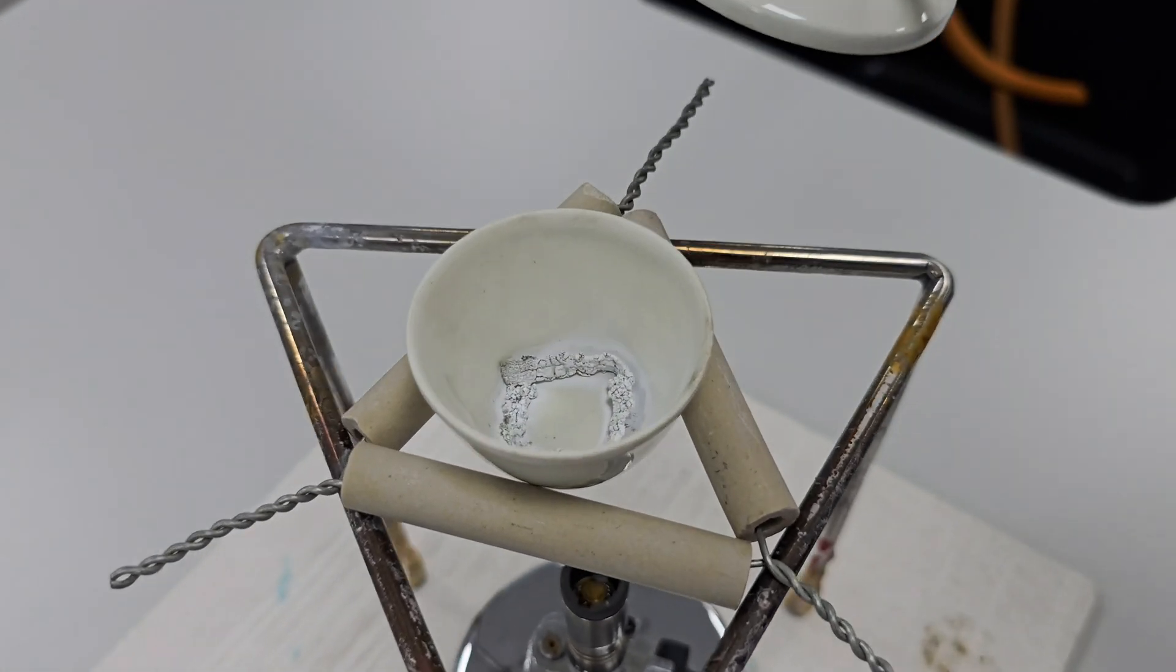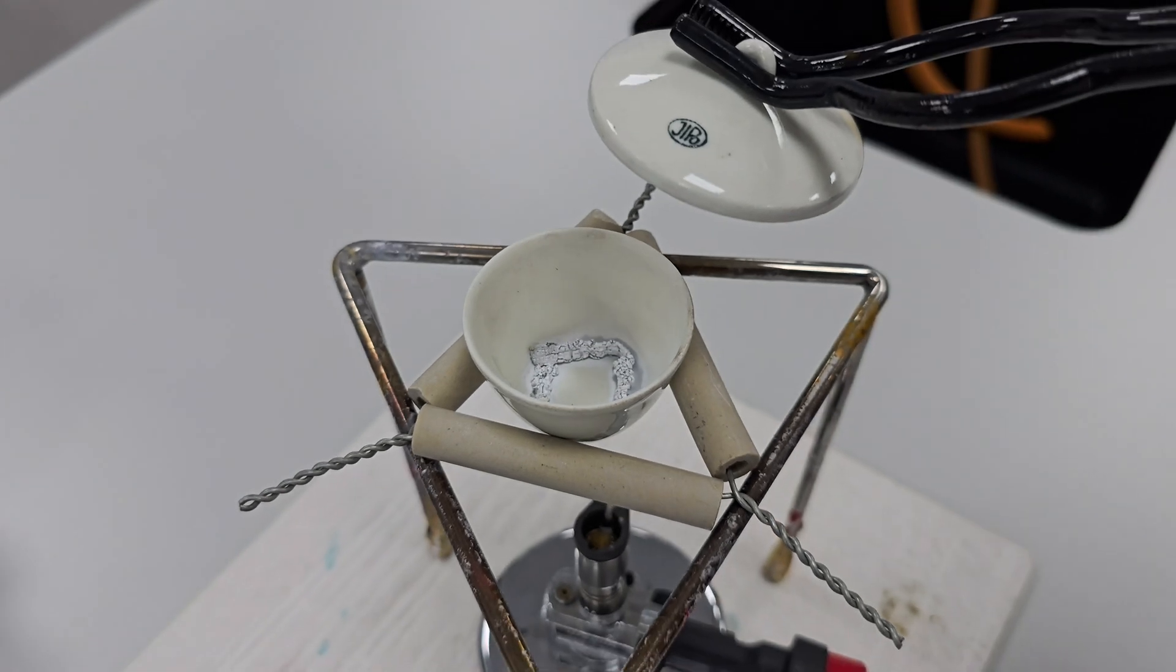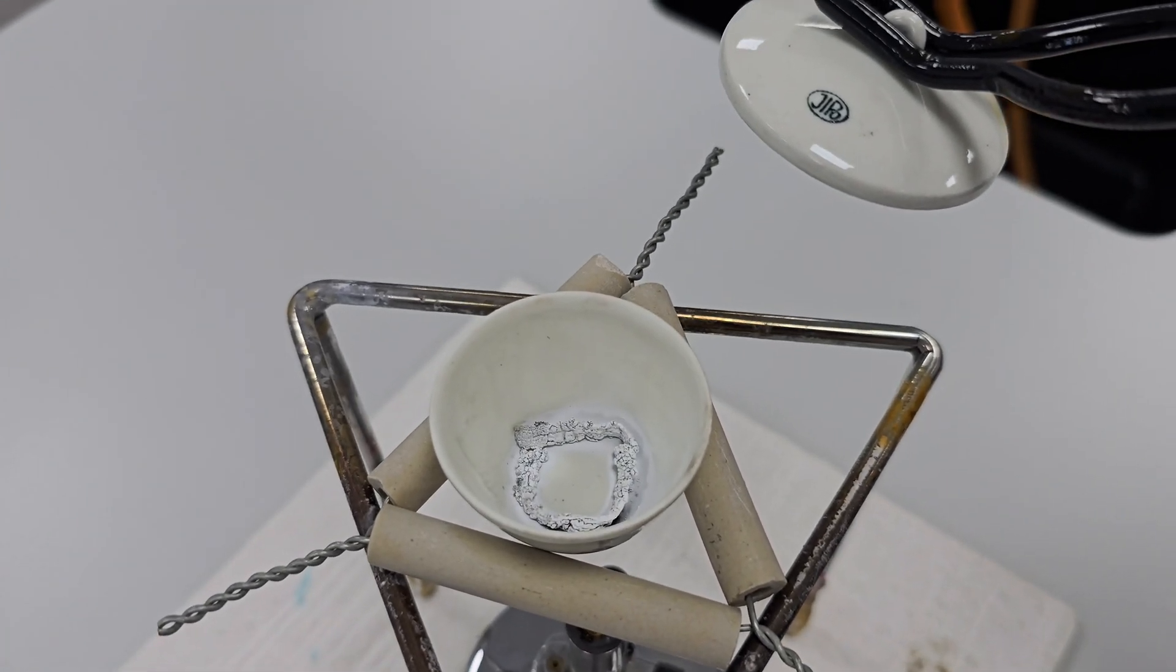Once the magnesium has completely turned into this white powder, magnesium oxide, we allow the crucible to cool down before taking the next measurement.